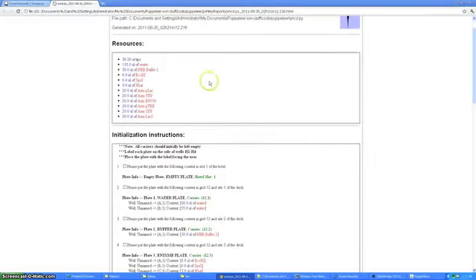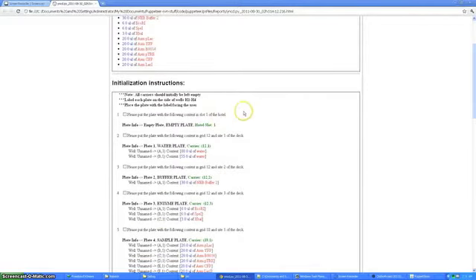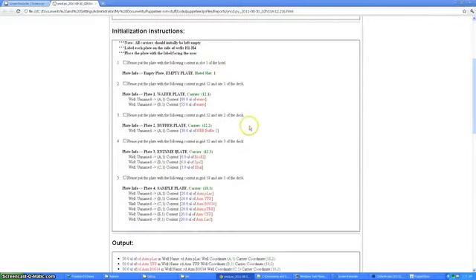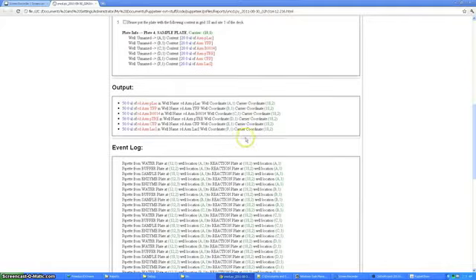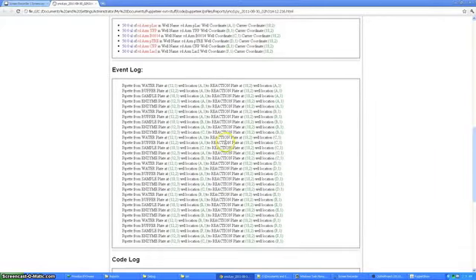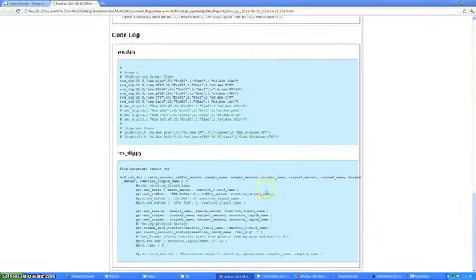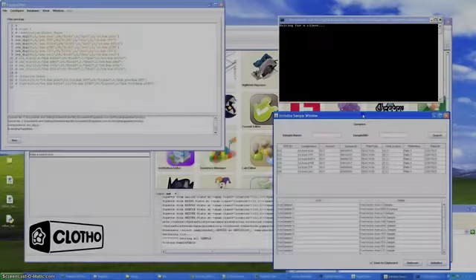When a protocol is executed, Puppeteer produces a comprehensive report detailing the volumes of reagents, the number of tips, and the number of plates used.